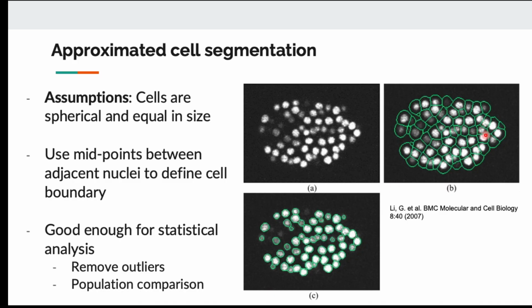In this case, an algorithm like the one shown in this panel basically assumes that the cells are clustered together. So we are seeing a clump of cells, and each cell is roughly the same size. From each center of the cells that we identify using the bright signal, we're going to grow the area, let the area expand until it touches the other.